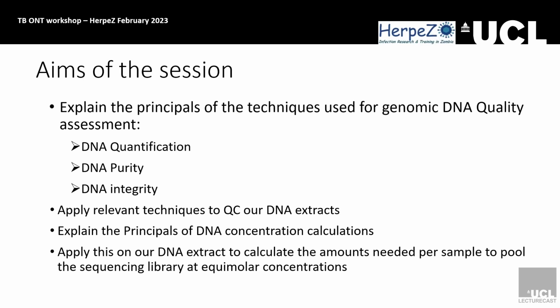For the one that has a high concentration, when you make up your solution that's going to be taken through to sequencing, you're going to use less volume of DNA than for your samples with a lower concentration. You want to use more volume so that you get an equal number of reads across all your different barcodes for your samples.